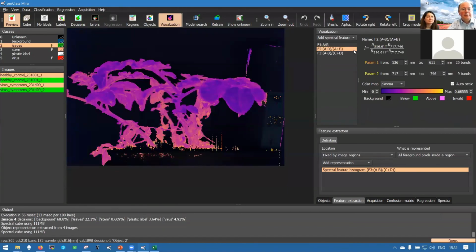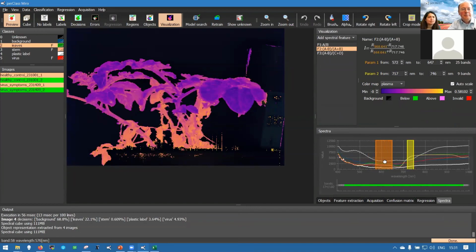And what we find very useful about this whole process, also for ourselves, is the possibility to really directly see the feedback. And often we actually use this not only to compute spectral indices, but actually uncover things that were not clear to us in spectral cubes in different contexts.